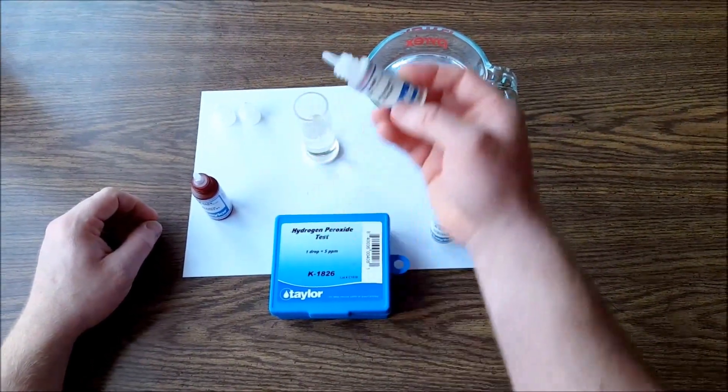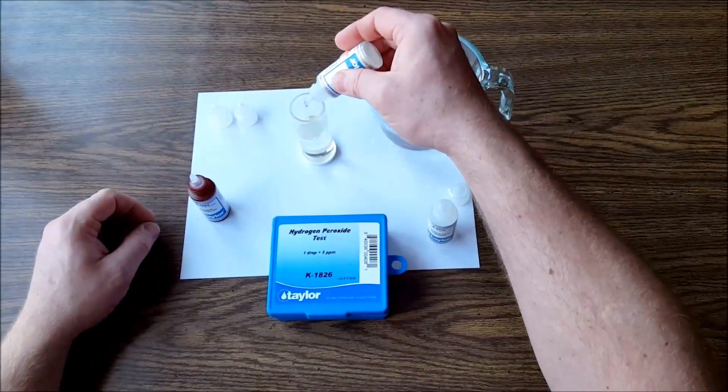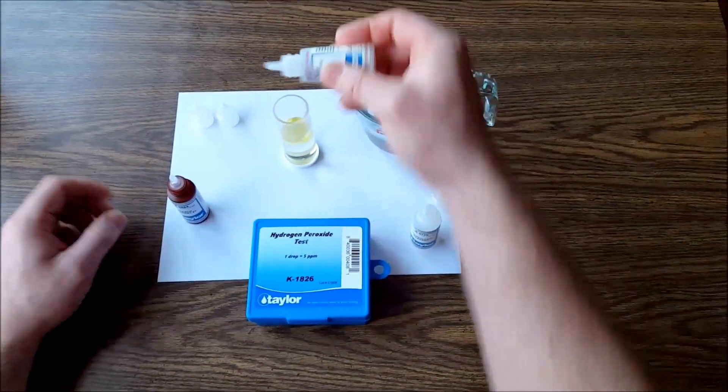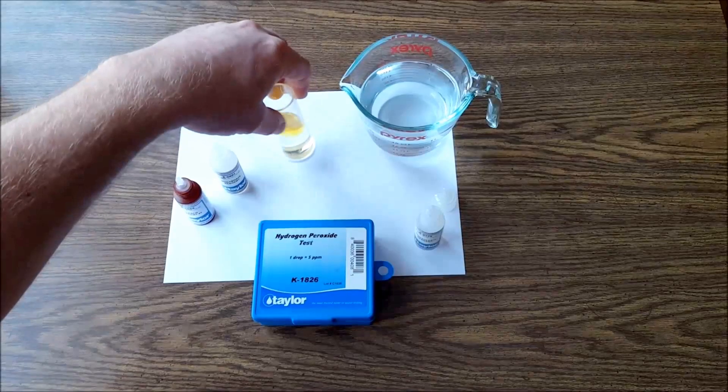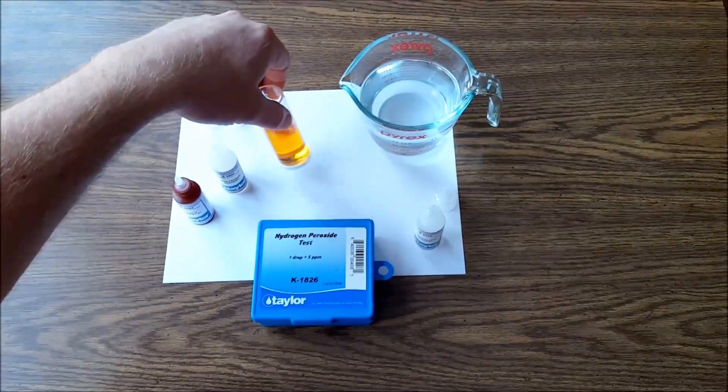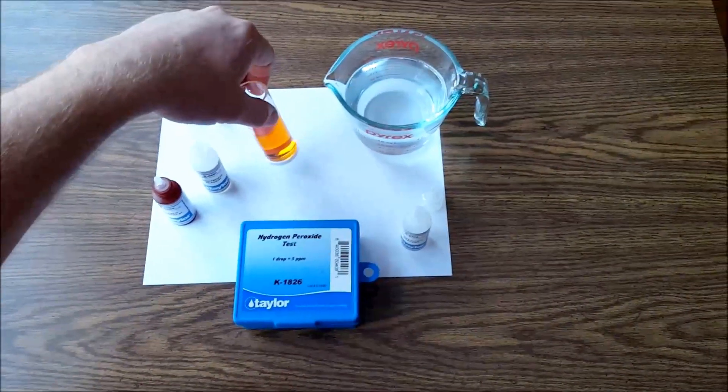And then your molybdate reagent—I have no idea if I'm saying that right—but nevertheless you put 10 drops in there: 1, 2, 3, 4, 5, 6, 7, 8, 9, 10. Now you'll see how it starts turning yellow, and that means that hydrogen peroxide is present inside of there. So you give it a good swirl and make sure it's all uniform in color.